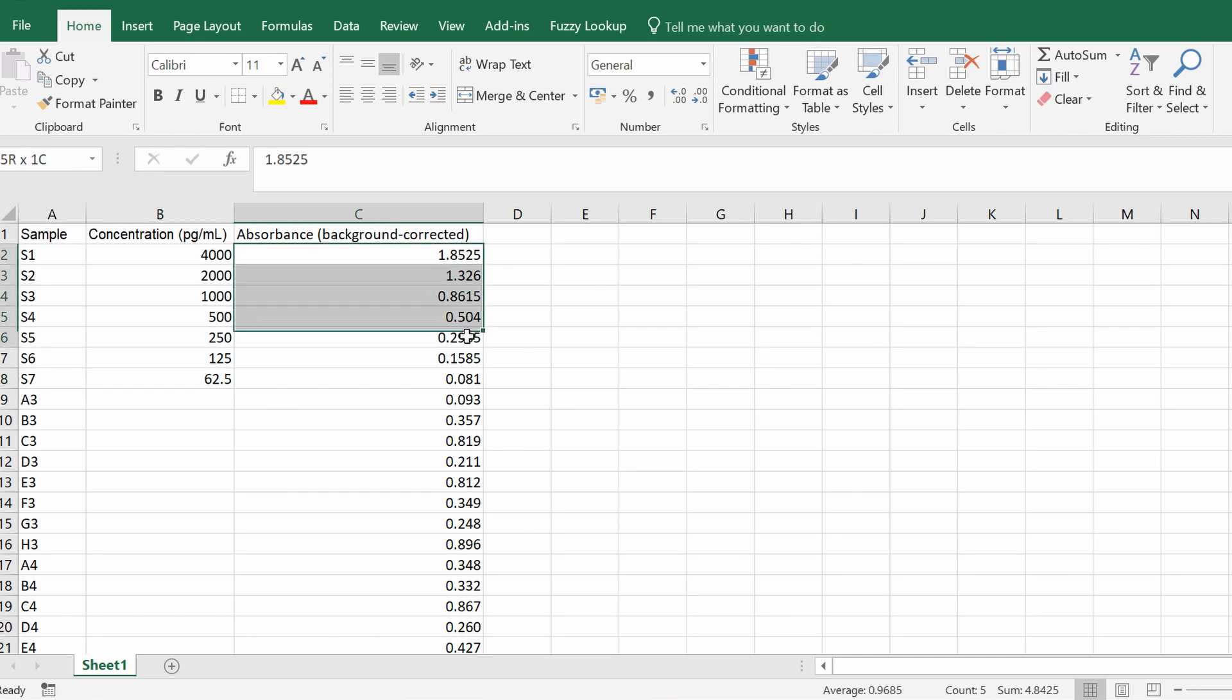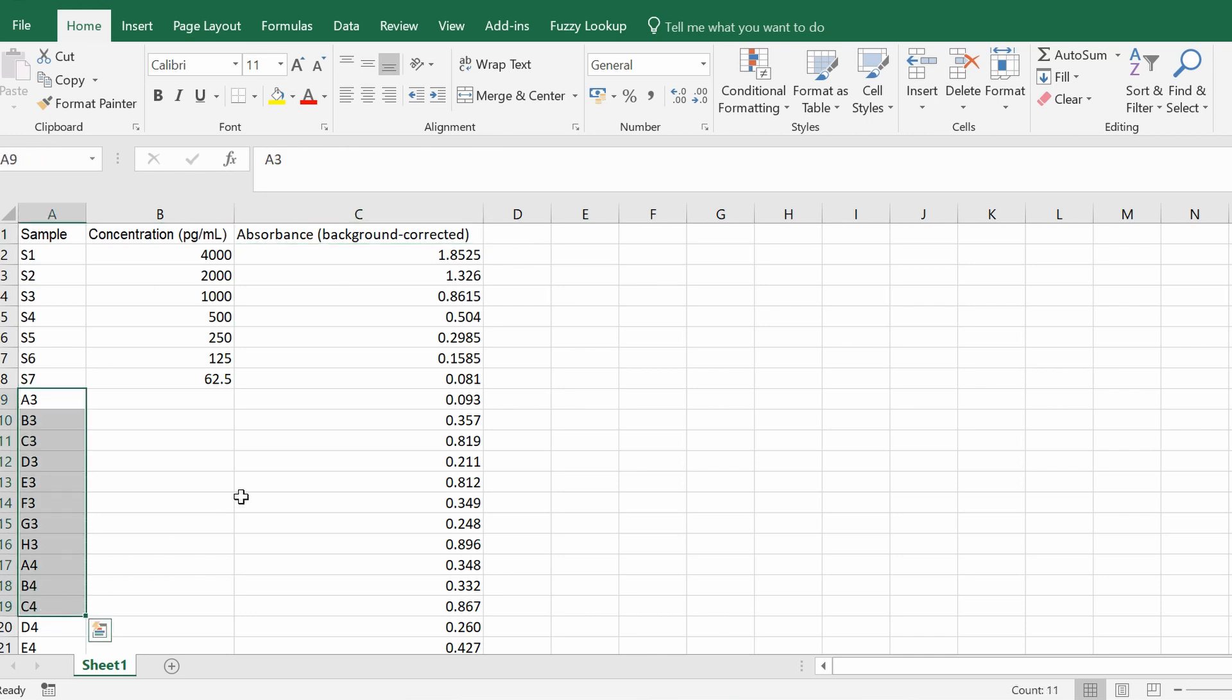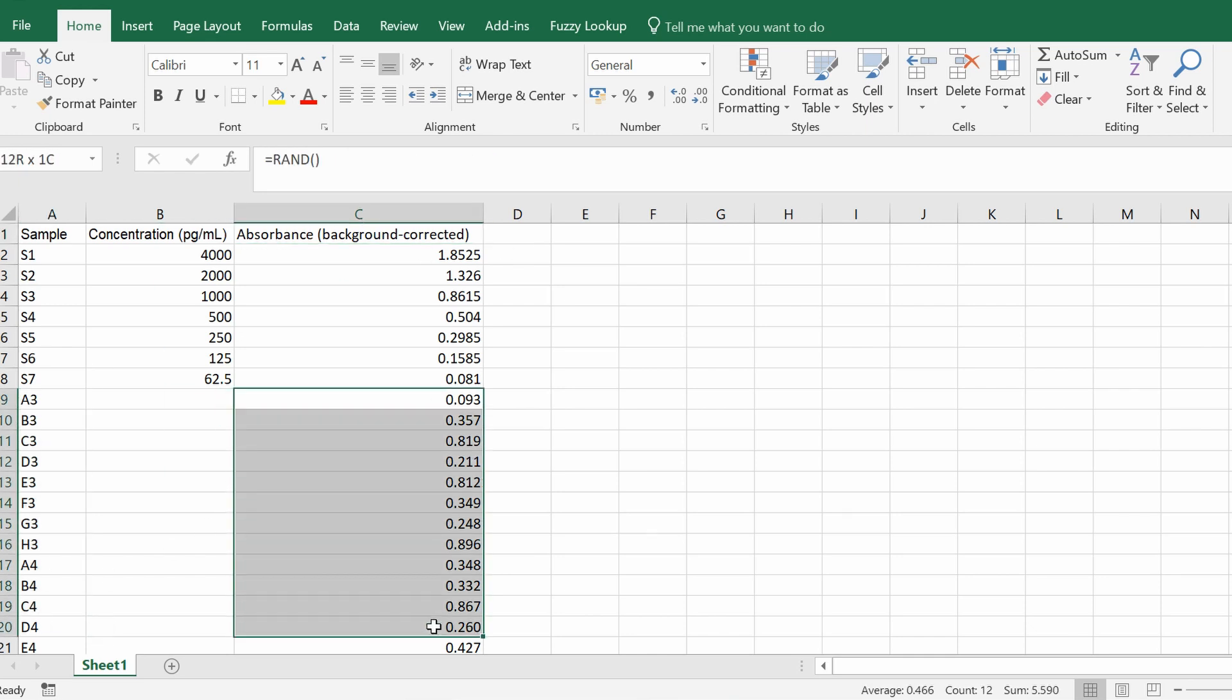This column represents the background corrected absorbance. So I've already taken away my background signal from all of my wells, and then underneath this I have my samples and their absorbance values.